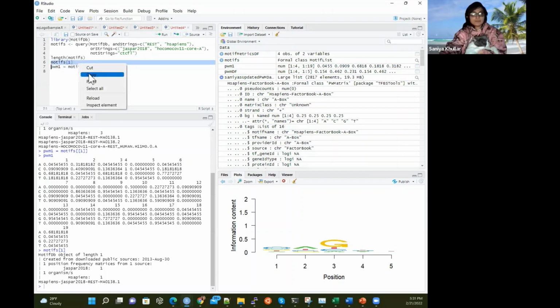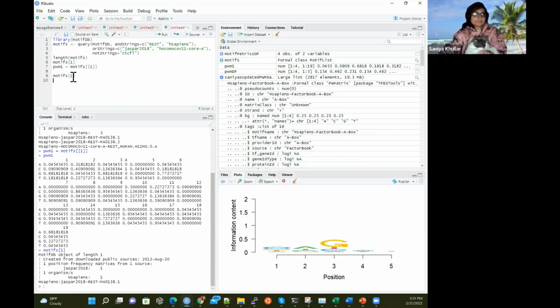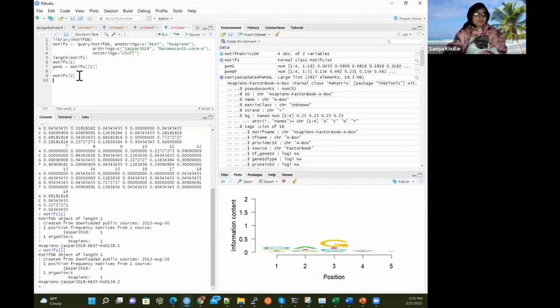We can look at motifs 2, for instance. But before we do that, you can already see that in motifs 1, there are some really great positions, like the 4th position where there's a 100% chance that it's going to be C. That is awesome. That's what we like to see. And some are flat out 0, that can never happen, which is also really great. And there are some areas where we may not know as much about, or there may be some uncertainty. Like here, maybe this first base is not the greatest, or the second base, but there are some that are really good, strong results, like the 14th. So that's the probability weighted matrix there.